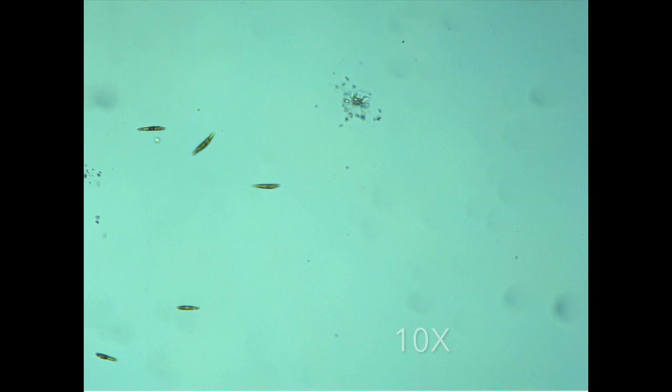To test out my original question, I had to come up with an experiment. For my experiment, I took 1 drop of euglena and 1 drop of ice-cold water and put them on a slide and then covered the slide with a slide cover. I then placed the slide under the microscope and observed the movement of the euglena compared to what I had observed earlier. Before I did this experiment, I hypothesized that the ice water would slow the euglena down and could possibly not make it move at all.